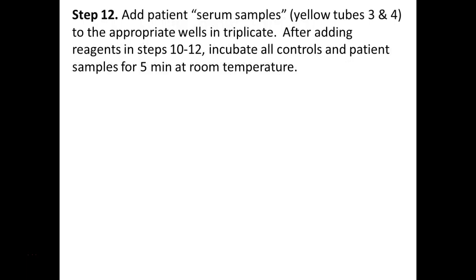So then you have two patients that you're looking at today, 3 and 4. As you can guess, somebody's positive and somebody's negative. Your challenge today is to find out who, right? What the answer is.